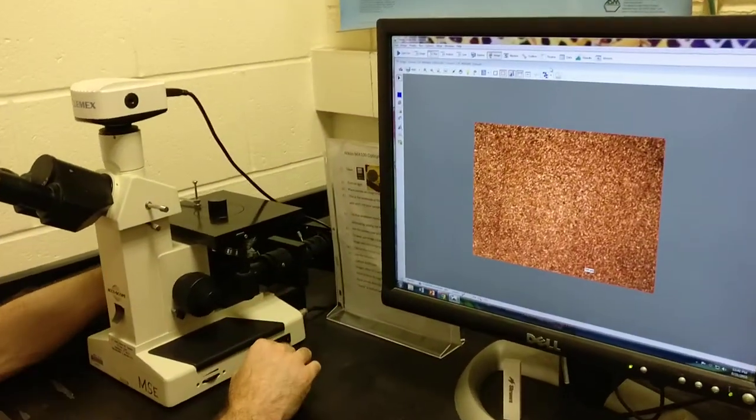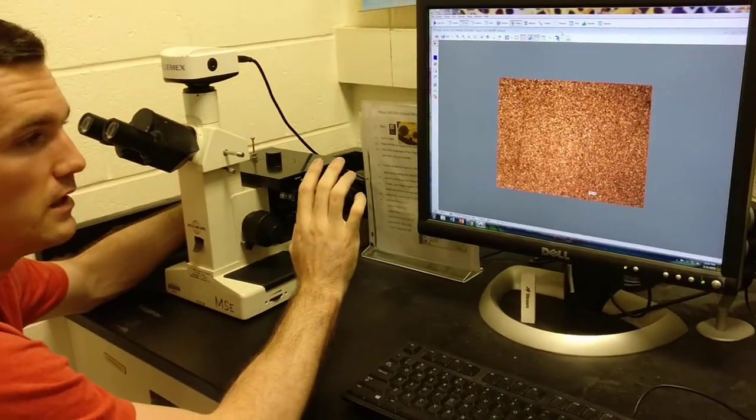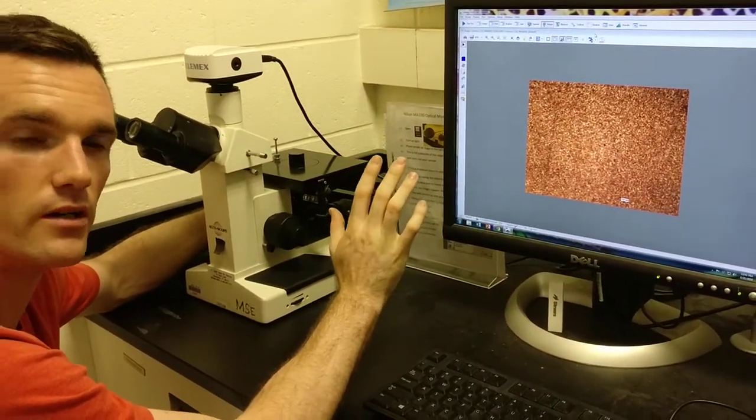So we have 50x here. We're going to take microstructure images probably around 200x to 400x so that we can actually see grains. And grains appear around that size.